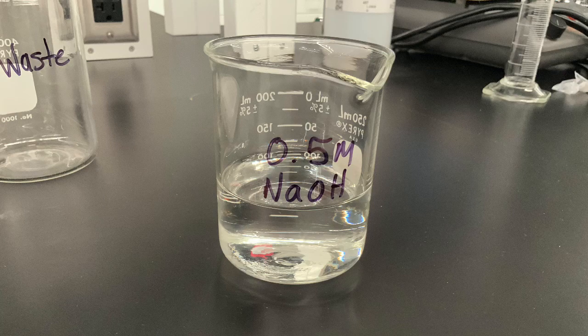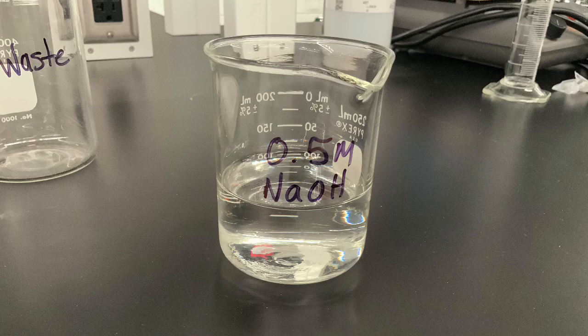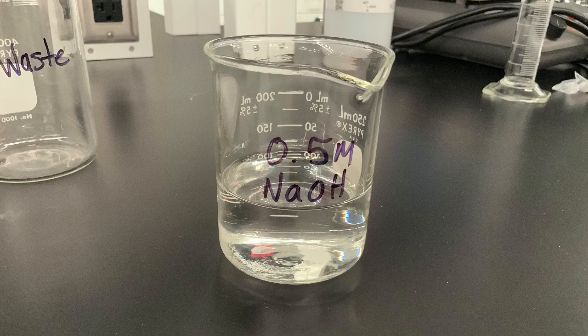In this lab, we will neutralize acetic acid in a vinegar sample with 0.5 molar sodium hydroxide solution. We will add the sodium hydroxide solution from a burette into an exact volume of vinegar solution.